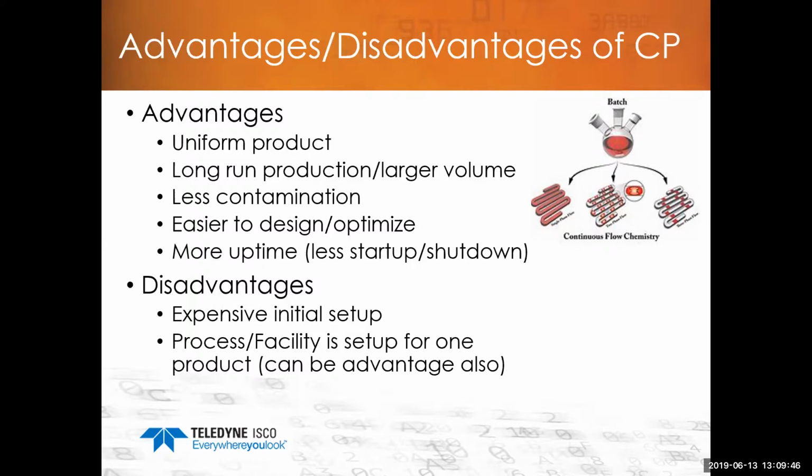Sometimes it can be expensive. The initial setup can be expensive. There is some investment depending on the type of pumps you use. If you don't need the more expensive pumps, you can get away with the less expensive ones. Obviously the upfront cost is less.